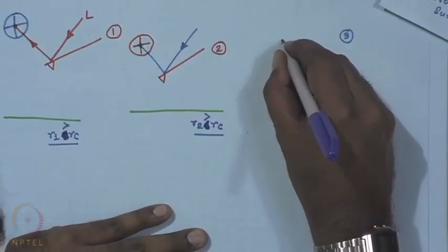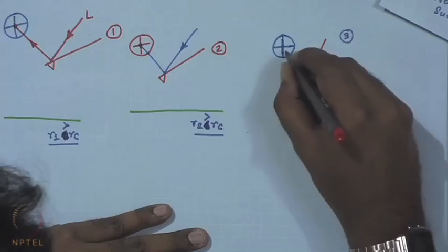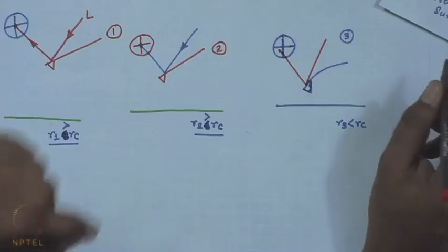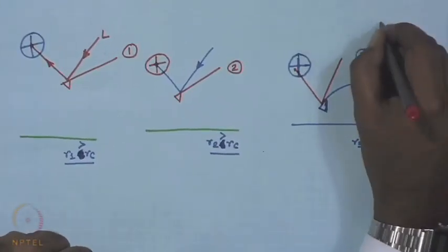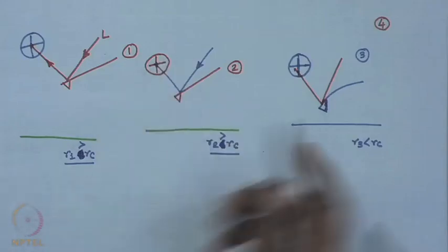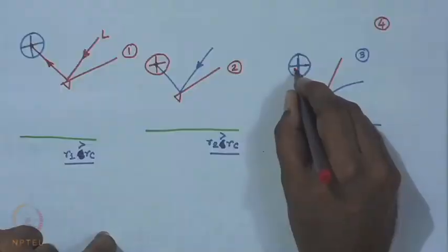And simultaneously what happens is, now since there is a deflection on the cantilever, the laser light no longer falls on the center, but it sort of shifts, and this is exactly how a deflection is spotted. So, if you compare with the fact that at perfectly aligned condition the deflection was 0, you already see that because of this deflection corresponding to the attractive force experienced by the tip due to the approaching surface, there is already a shift in the laser light.